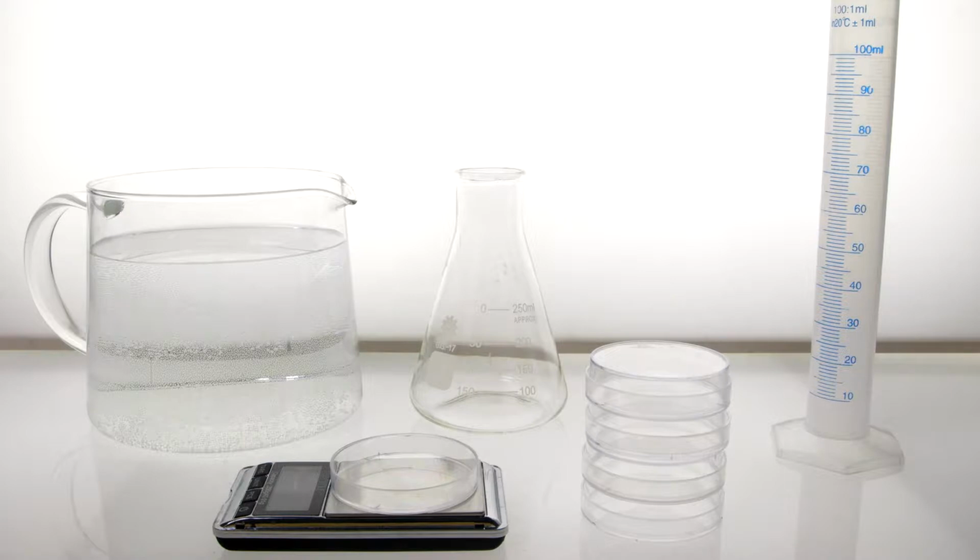LB agar plates are both the food and scaffolding that are used to grow bacteria. You'll need to create two different kinds of plates. The majority of plates, called selective plates, will contain antibiotics, and a few plates, called non-selective plates, don't have any antibiotics. The method you use to make your agar plates will depend on what equipment you have available to you, but the principles are the same.